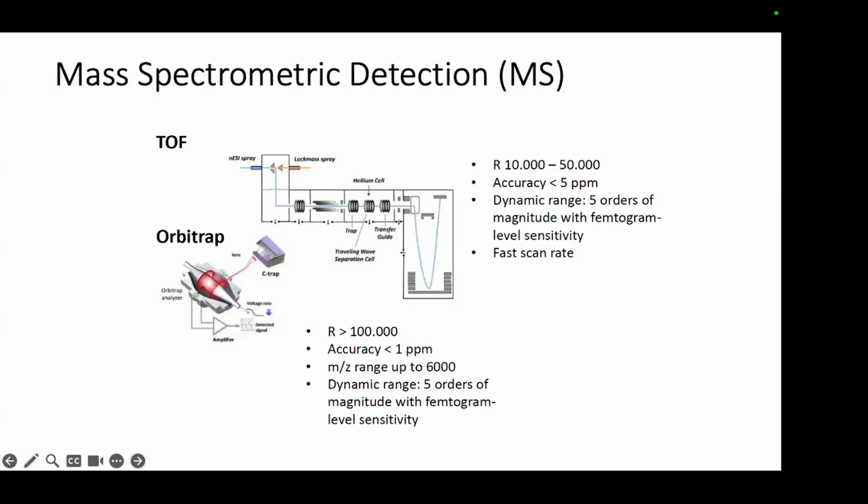Yes, it does. Thank you. Yeah, because a lot of times the difference between the molecules is so small that it has to be able to scan for that, especially with amino acids. Yes, yeah. So when you start stepping towards protein peptides, that's where you start having an advantage of using Orbitraps. For some lipids as well, it's an advantage too. Of course, it's a top-notch instrument. So if you can have that, it usually performs very well for metabolomics as well.